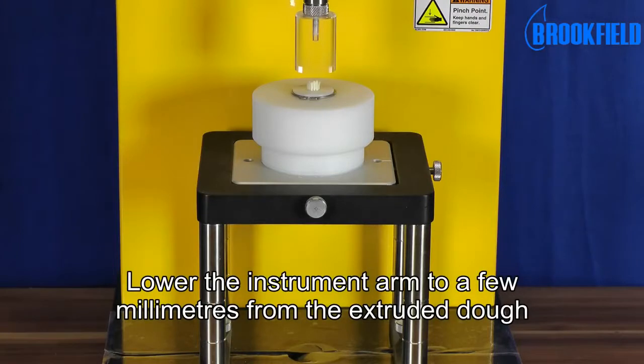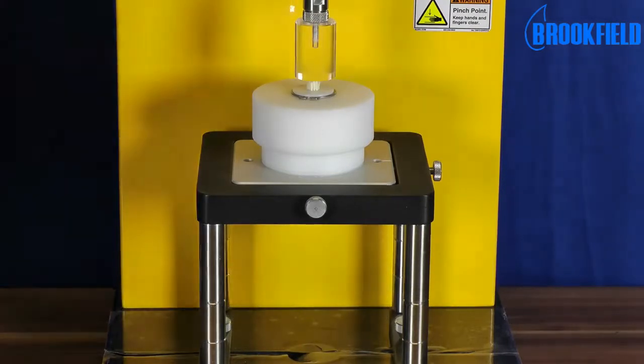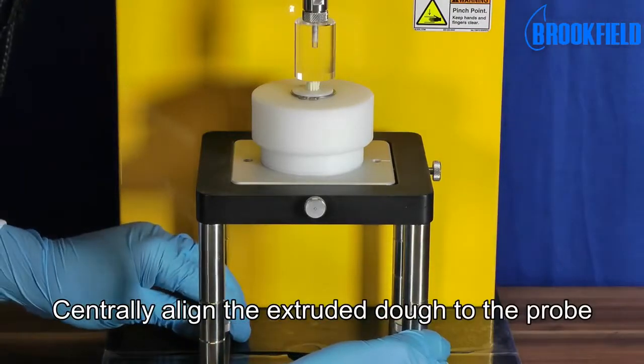Lower the instrument arm to a few millimeters from the extruded dough. Centrally align the extruded dough to the probe.